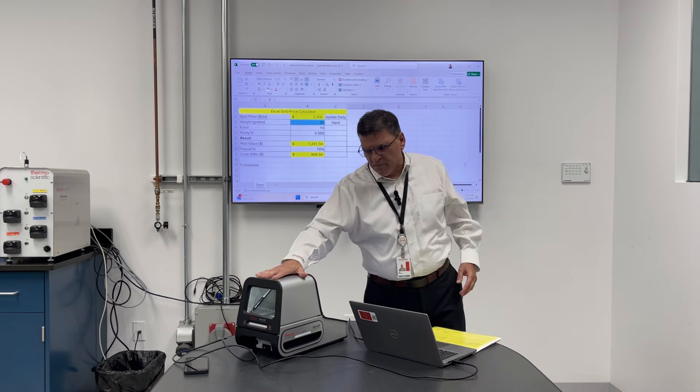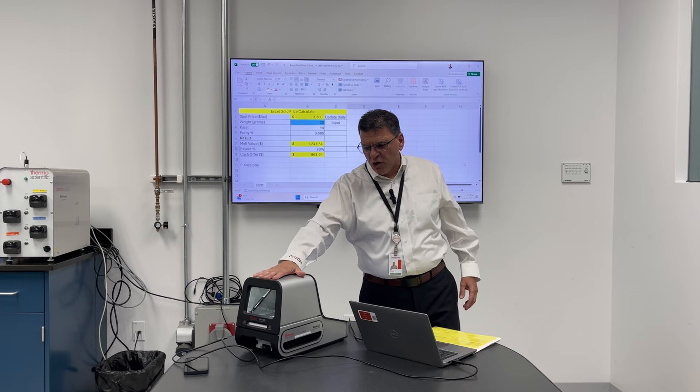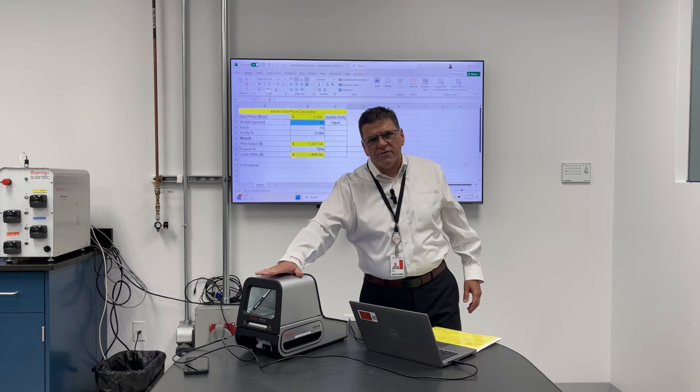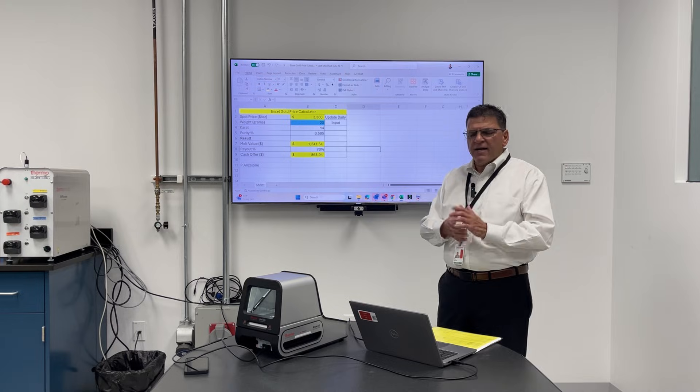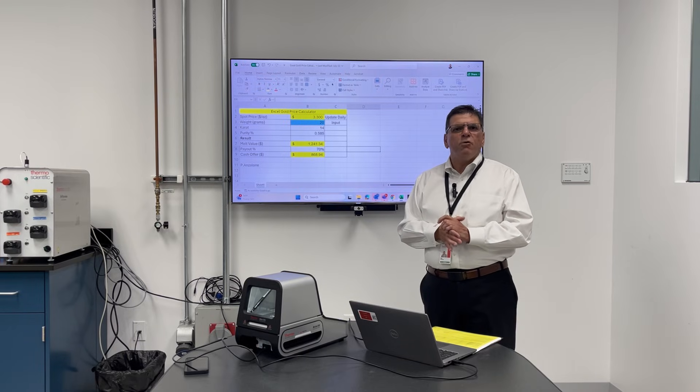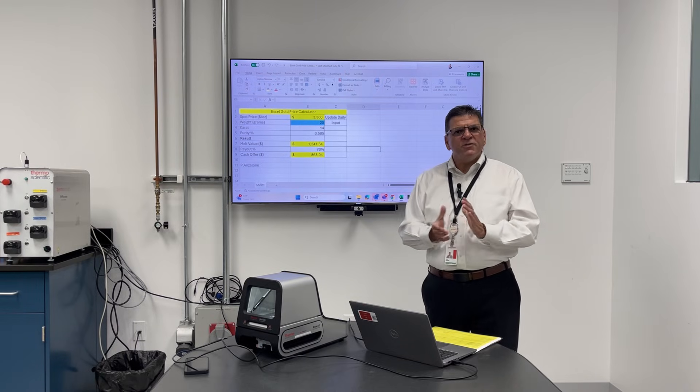This benchtop is typically used in pawn shops and jewelry manufacturing for authenticating gold. We also have handheld XRF if you need portability. Thanks for this opportunity.